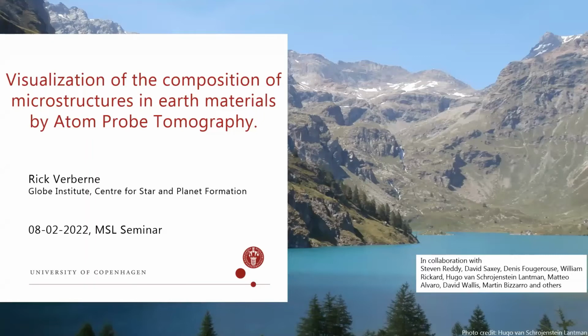Yeah, so today I want to talk about the visualization of the composition of microstructures in earth materials, and the technique we are using is Atom Probe Tomography. I will mainly be showing a couple of different research projects we were working on and others as well, and not so much go into detail about the different topics, as to show what we can do on different types of microstructures.